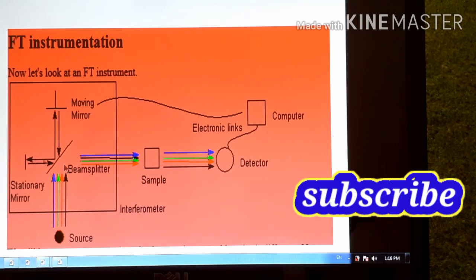The Michelson interferometer basically consists of two mirrors. One is a stationary mirror and the other is a moving mirror, and a beam splitter. The radiations that come from the radiation source are in the IR range, and when these radiations strike the beam splitter, they are divided into two beams. One radiation beam moves towards the stationary mirror and the other moves towards the moving mirror.